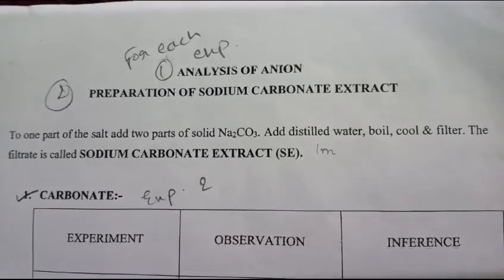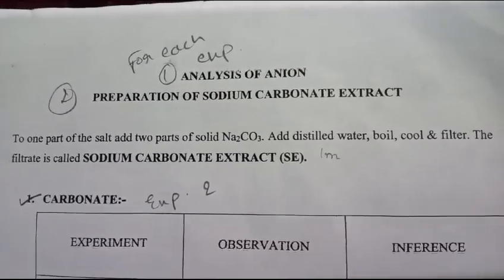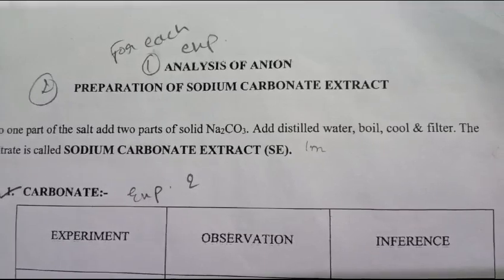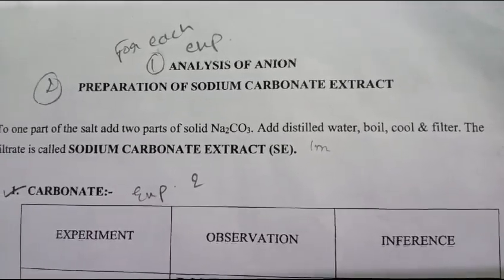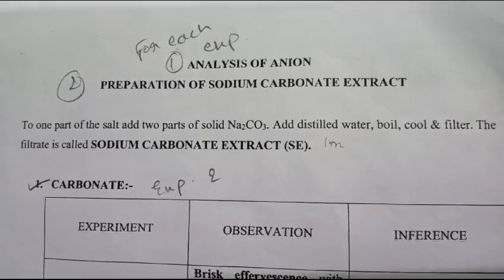For anion, prepare sodium carbonate extract. Take a test tube, add one spatula of the given salt, and two spatula of sodium carbonate. Add distilled water, boil, then cool and filter. After filtering, the solution which you get in your test tube is called sodium carbonate extract.